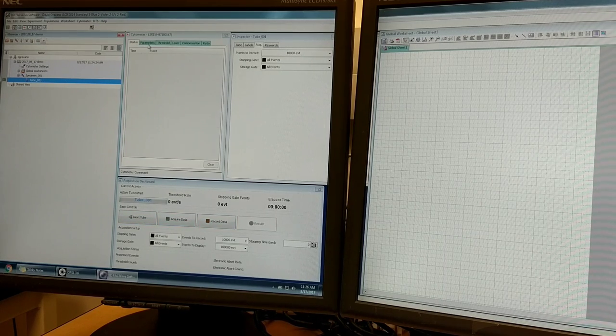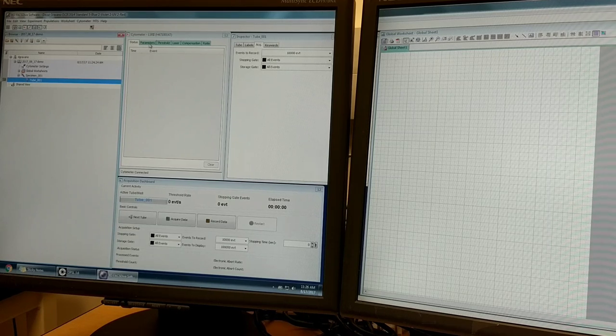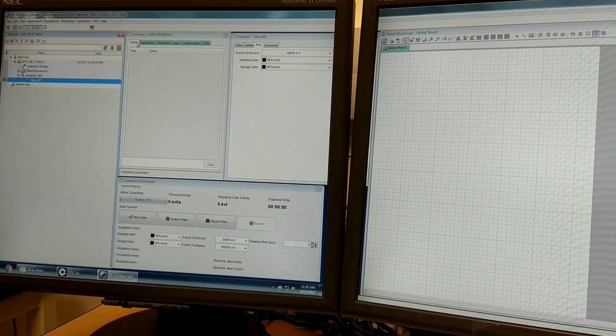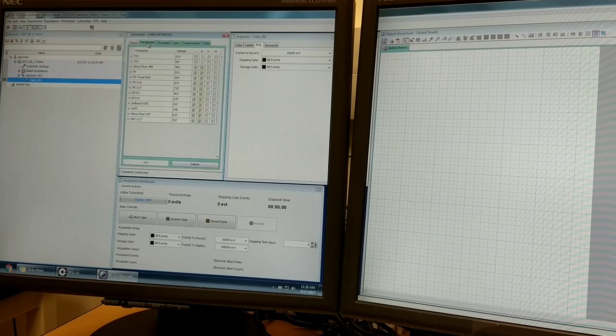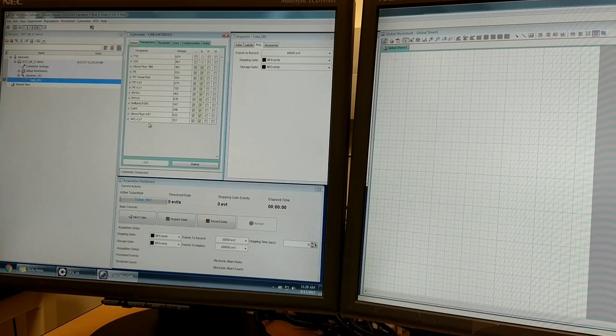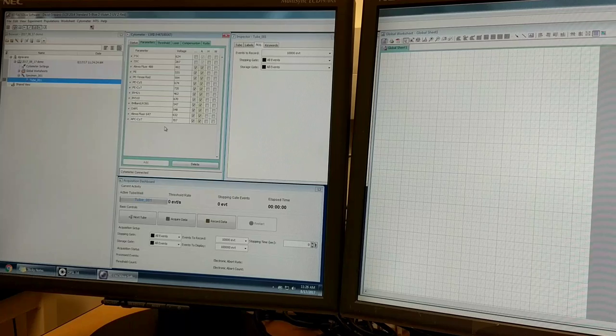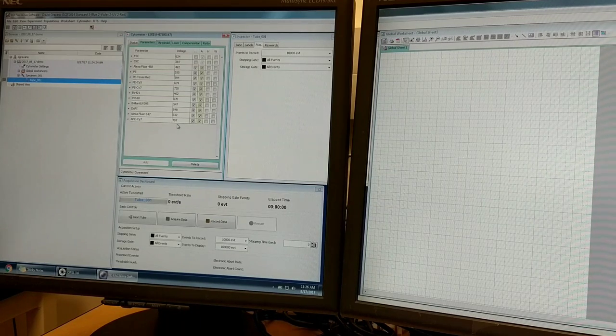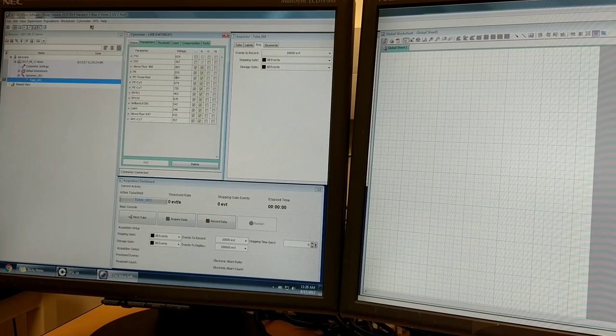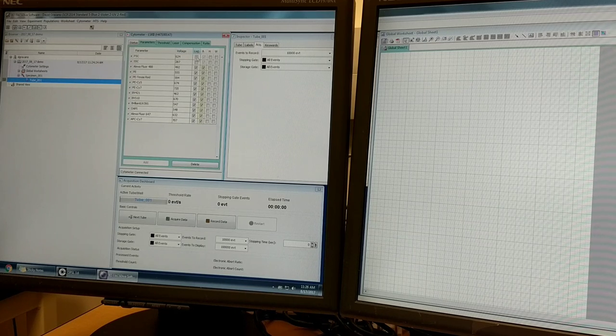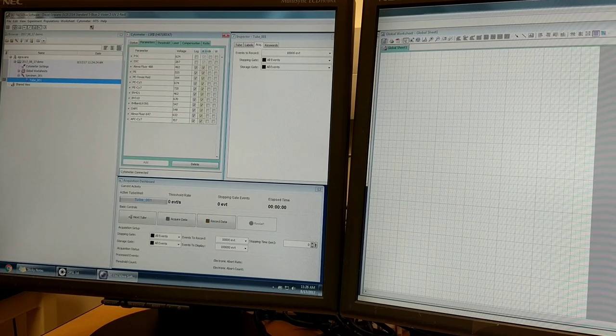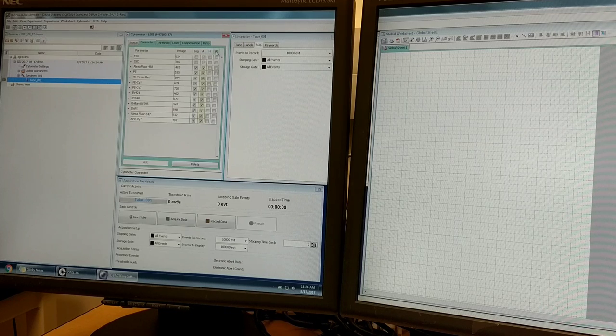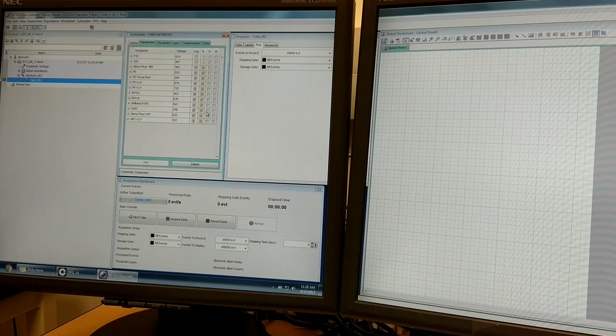The first step when you're setting up an experiment is you have to tell the instrument what parameters you want to measure. We'll click on the parameters tab and you can see all the parameters listed that this instrument can measure, some voltages the machine thinks are optimal for each detector, as well as how the data will be measured in log scale and properties of the signal: the area, height, and width.